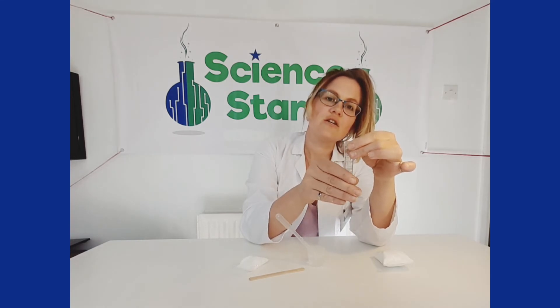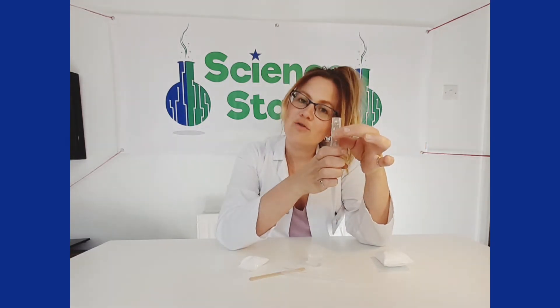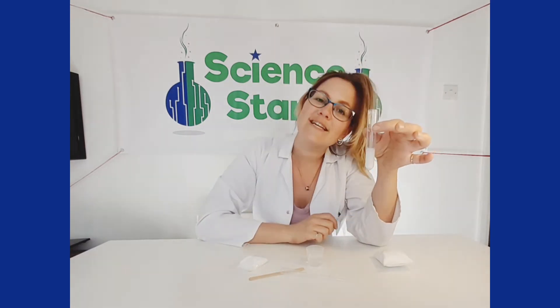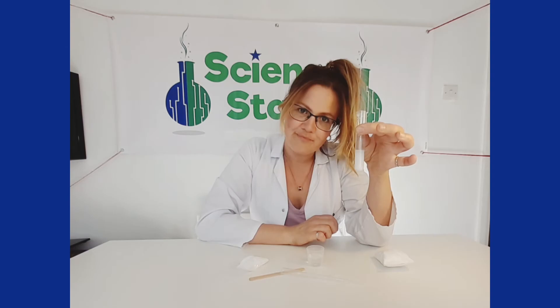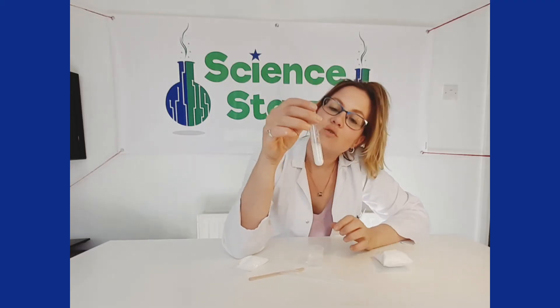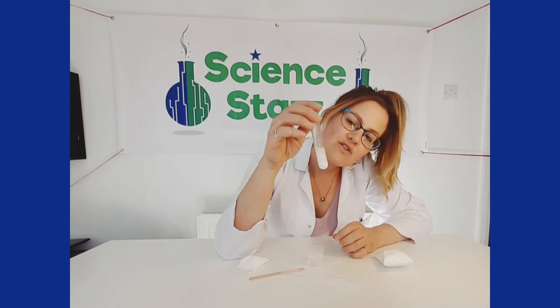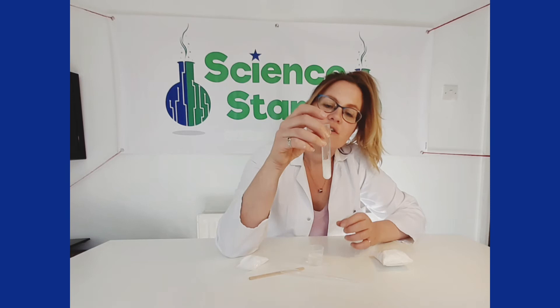Now put your hand on the side of your test tube — how does it feel? It should feel kind of cool, because this is something called an endothermic reaction. In an endothermic reaction, heat is absorbed, lowering the temperature of the mixture, thus making the test tube feel cold. As you can see, we've got bubbles — we didn't get any color change, but it fizzed, so it reacted.